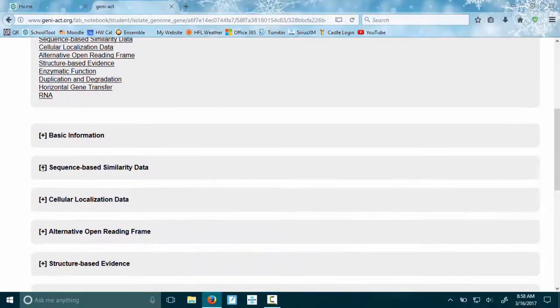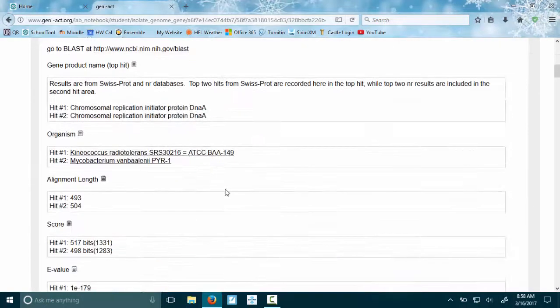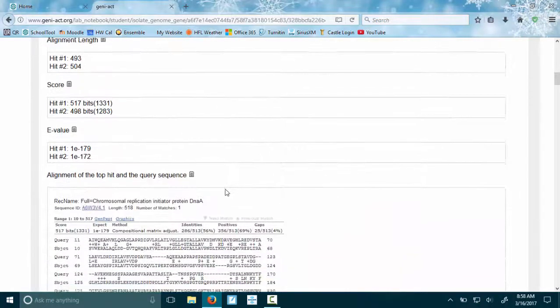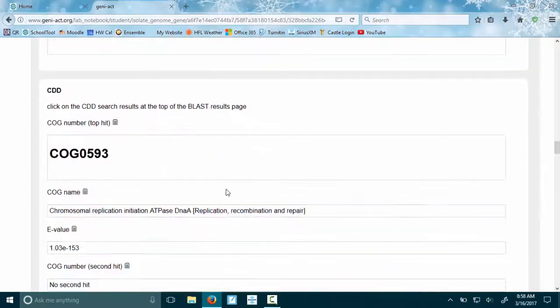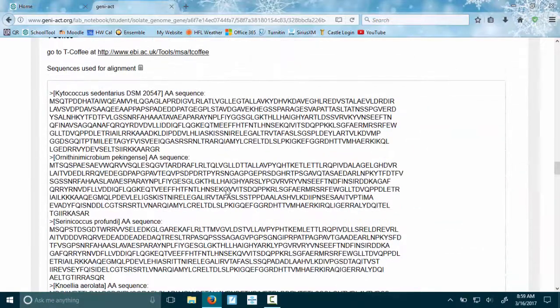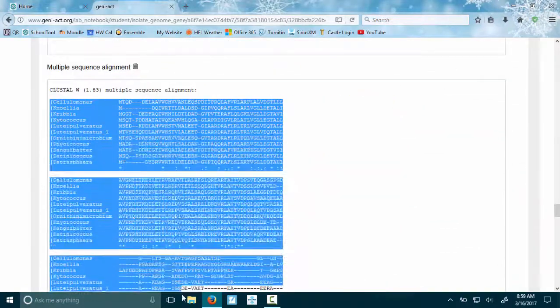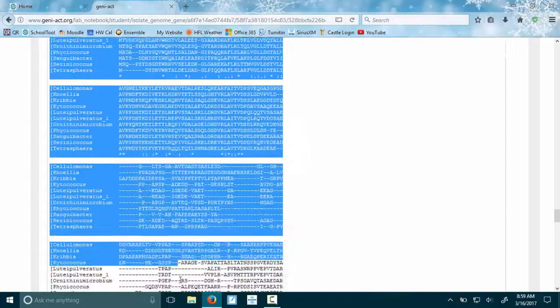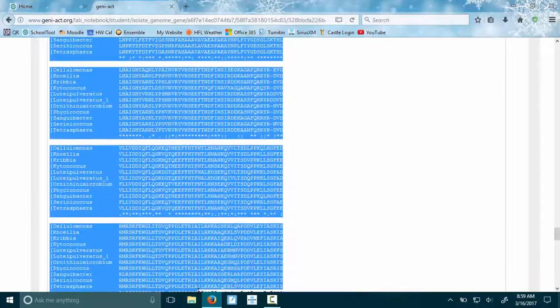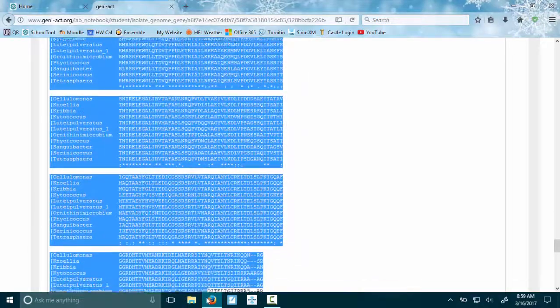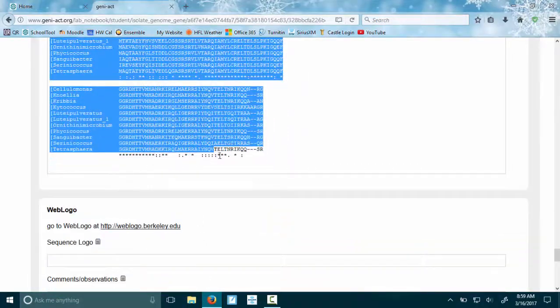In your sequence-based similarity data, we need the T-Coffee multiple alignment. This is just BLAST stuff, this was CDD. We are going to copy from the multiple sequence alignment that was constructed. Make sure you get everything but nothing extra, and I'm just Control+C.